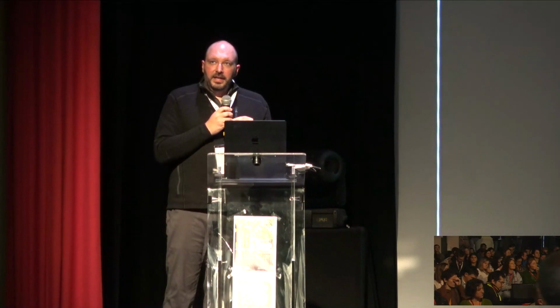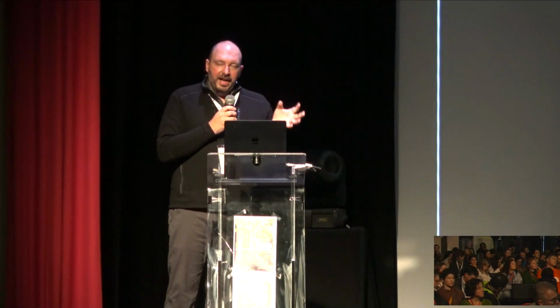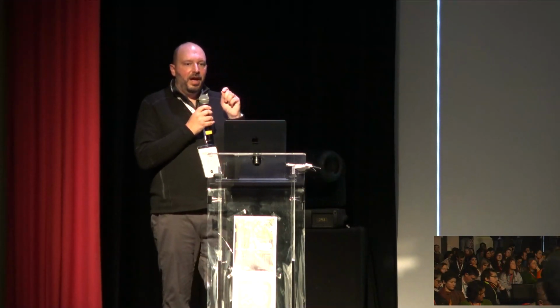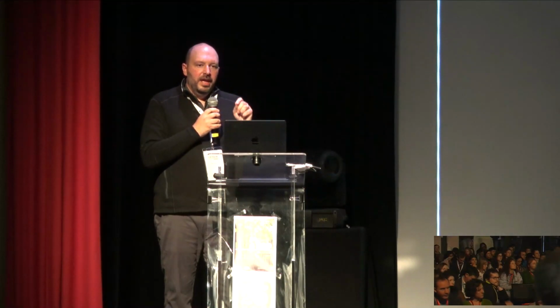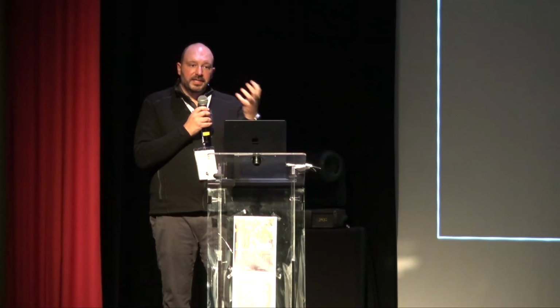For your other question, this is again in animals, but we have done pulse chase labeling, which I didn't have time to talk about today, where we can look at protein turnover, and we're fairly confident that the dye conjugate, the halo tag conjugate, is fairly stable over 2 weeks in the mouse brain, for example. So we can see signal for a long time. We can do pulse chase, quantify, say, protein turnover during learning and other cool things like that. So they're reasonably stable once they're attached to the halo tag. They are excreted, at least in an animal, if they're not bound to the halo tag.